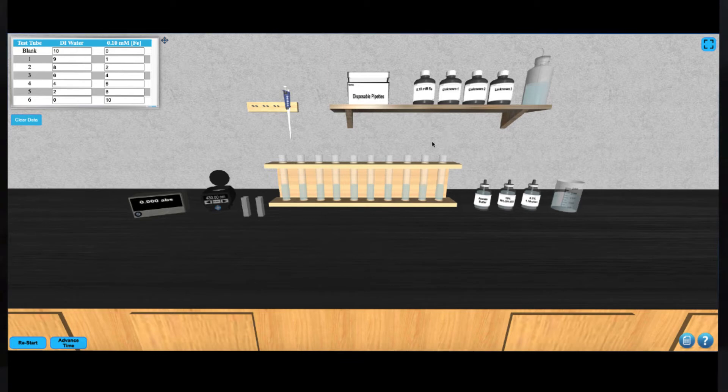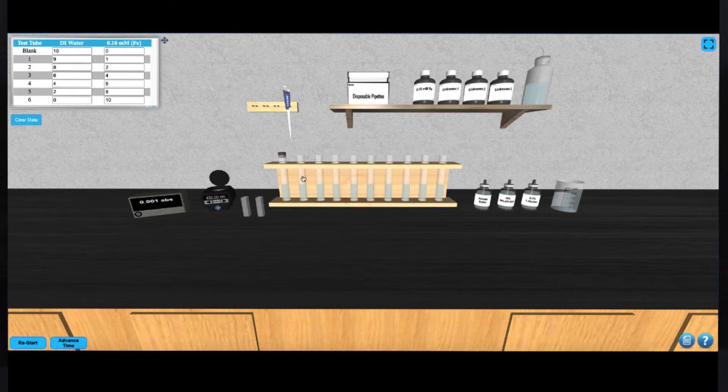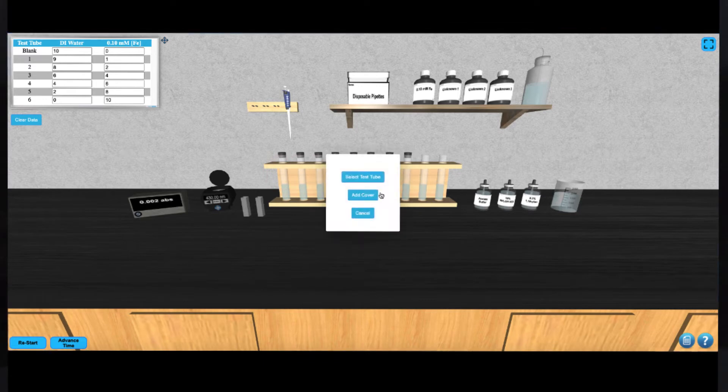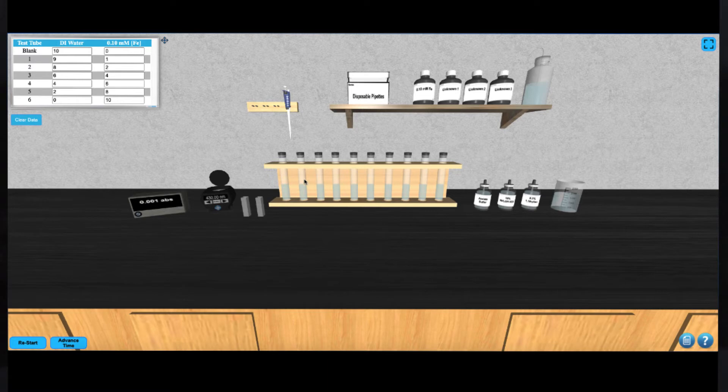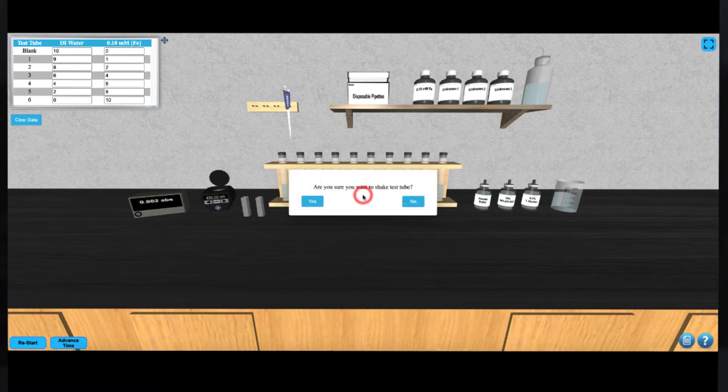Now you can add a cover to each tube by clicking on them. Next, you can shake them by choosing the option from the menu when you click on them.